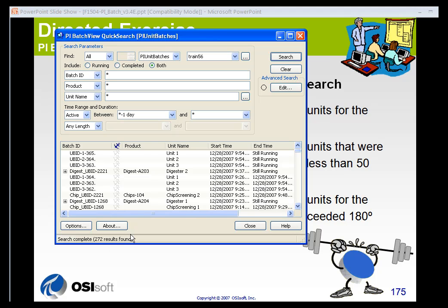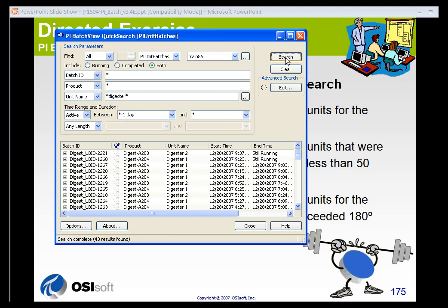I've got 272 unit batches that occurred on my server. I want to narrow that down — I want to use only the batches that ran in my digesters. So I'm going to put the phrase 'digester' in the unit name field and search. You can see that I have narrowed it down to 43 results — 43 unit batches ran in the last 24 hours on my digester unit.